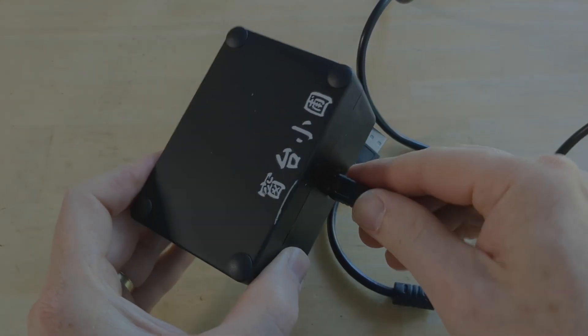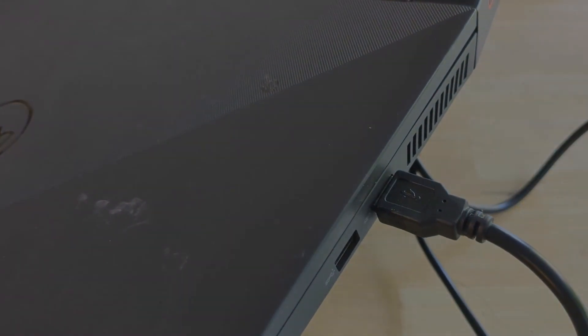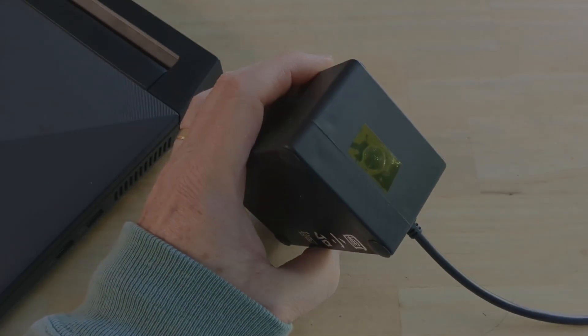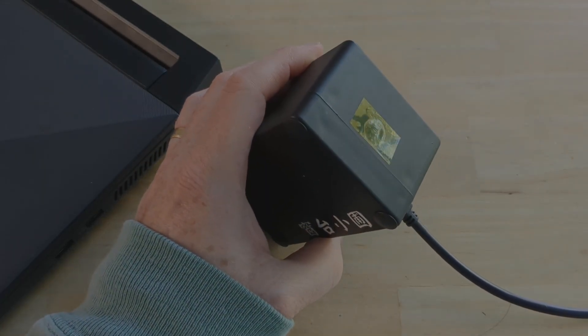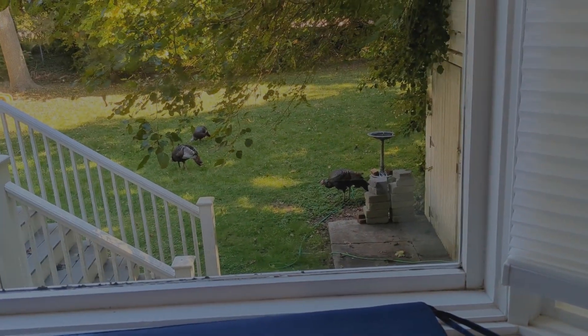Plug in the cable and plug it into your PC — I only know how to do this for a PC. I had to remove some yellow tape to connect the cable. I left the yellow tape on the other opening; I'm probably supposed to take it off, but it works fine with the yellow tape on.